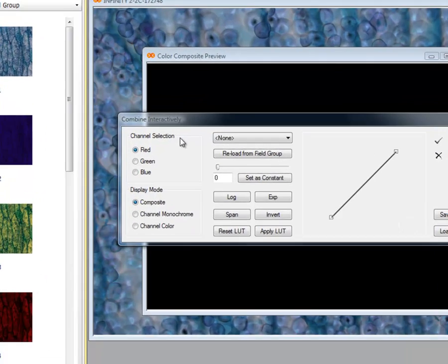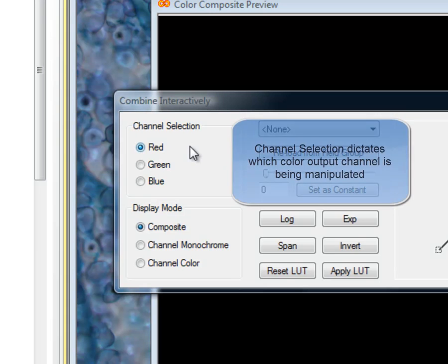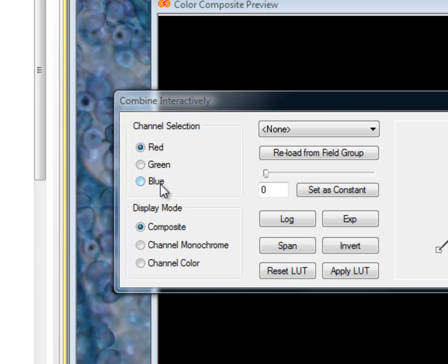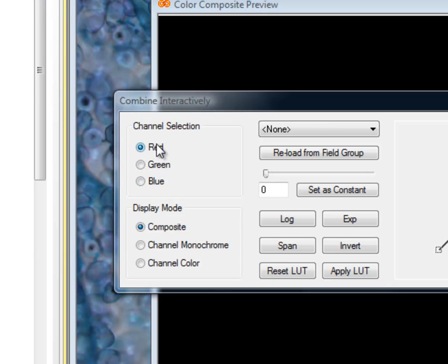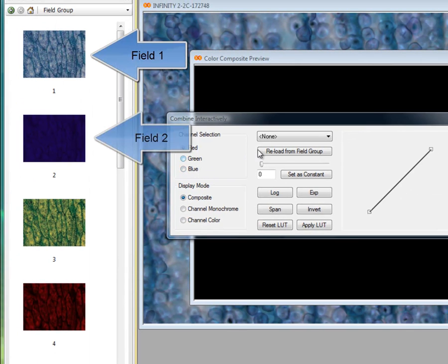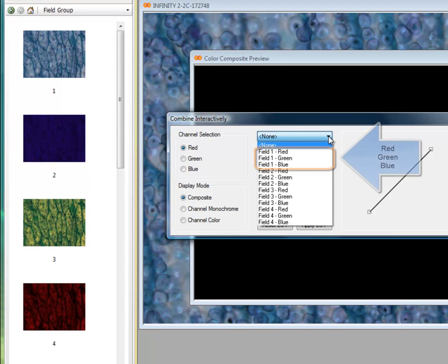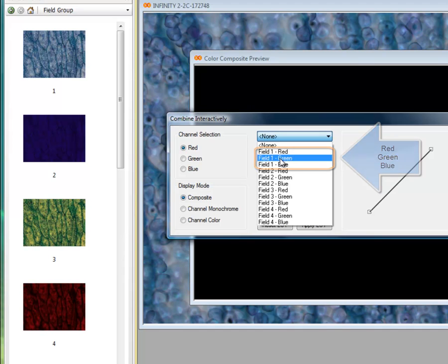The first area of interest on this panel is the channel selection — this is the selection for the output channel. Every image that we see in Analyze is composed of a red, green, and blue channel. Similarly, the color cameras use red, green, and blue filters within the camera sensor to produce the output that the camera sees from your microscope. Here we're going to manipulate those channels individually, so whether we're dealing with the red, green, or blue output channel is selected in this area of the dialog. You'll notice on the left-hand side we have four images, or what Analyze is calling fields, and each field consists of a red, green, and blue channel.